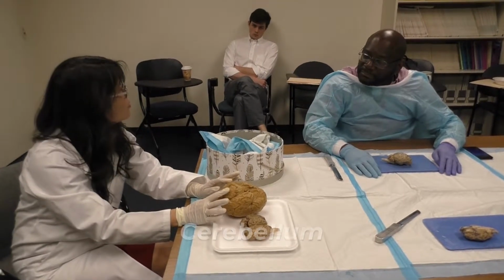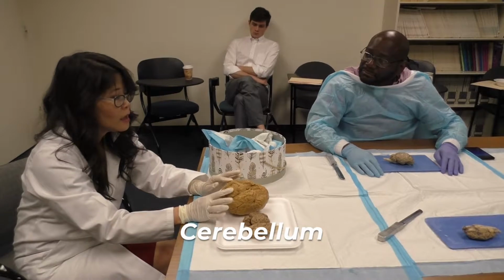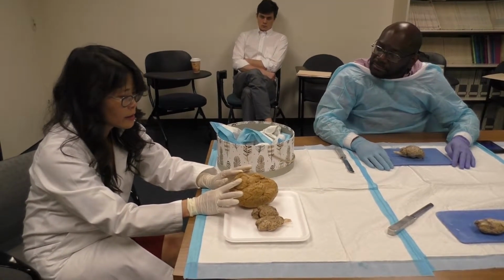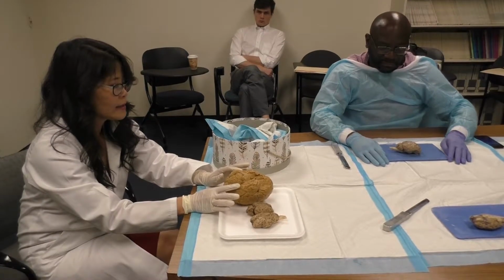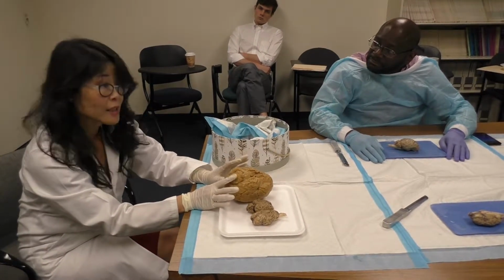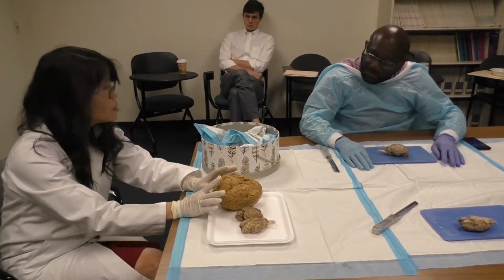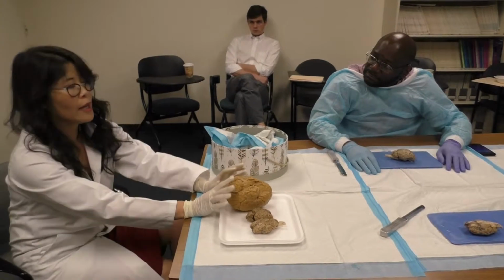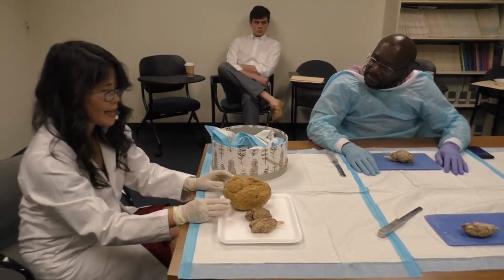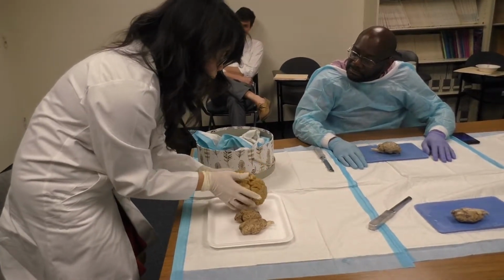What about the cerebellum? What does the cerebellum do? Balance, yeah, exactly. So if you have damage to the cerebellum, even something as, I was going to say simple, walking is not that simple. It's actually a very, very difficult, coordinated process that becomes much more herky-jerky, and you can't attain the smooth movement that the rest of us have. All right. So why don't we move on?